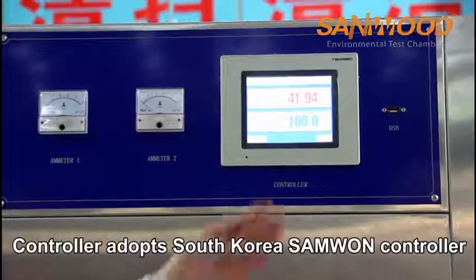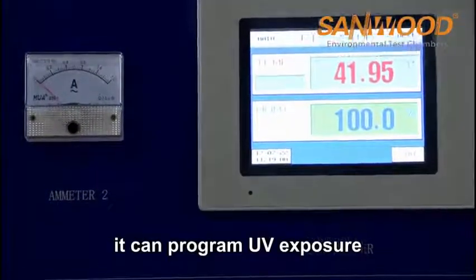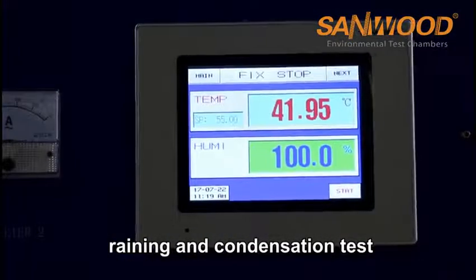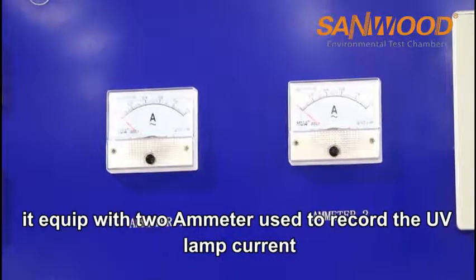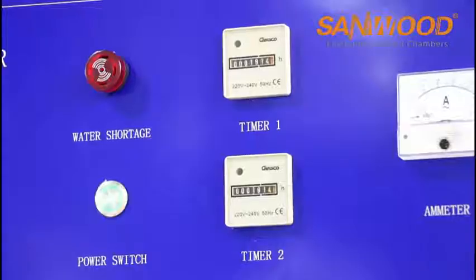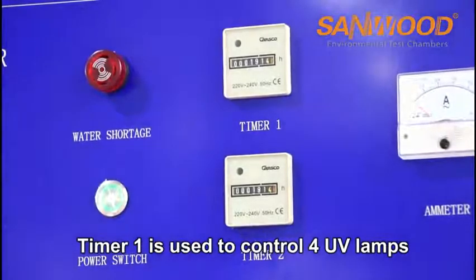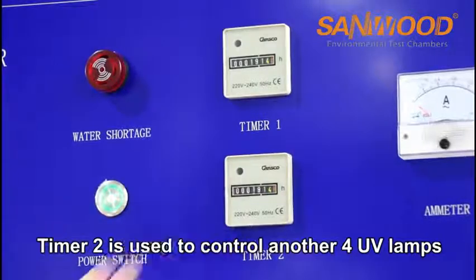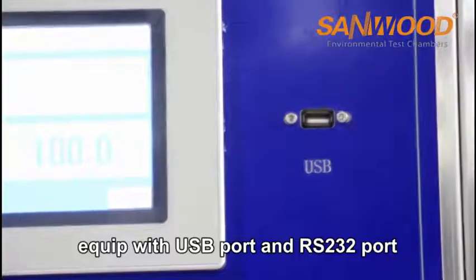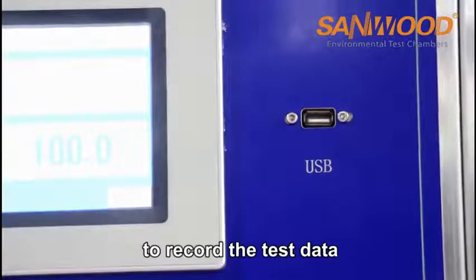The controller is a South Korea SAMWON controller. It can program UV exposure, raining, and condensation tests. The machine is equipped with 2 ammeters used to record the UV lamp current. There are also 2 timers: Timer 1 controls 4 UV lamps and Timer 2 controls the other 4 UV lamps. It is also equipped with a USB port and RS232 port to record test data.